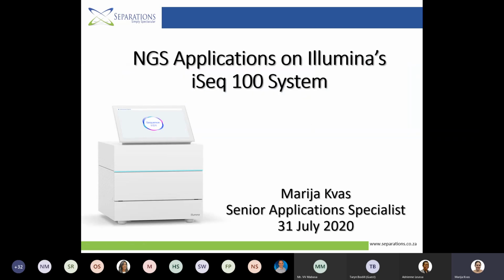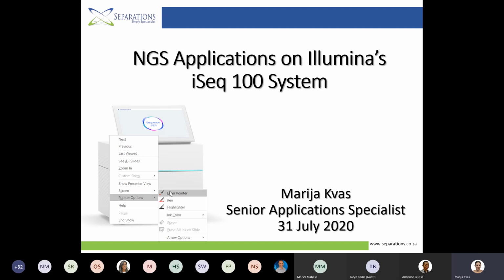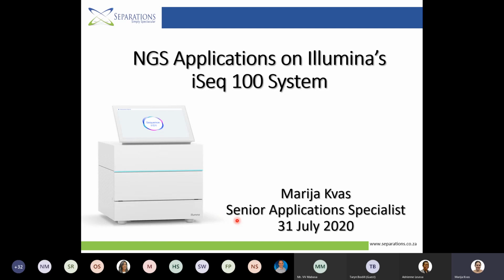There is another session later today at 11, and you can join us to have a look into iSeq and into the applications that entail iSeq. But for this morning, I will be talking about iSeq 100 and the applications that we can do on it.